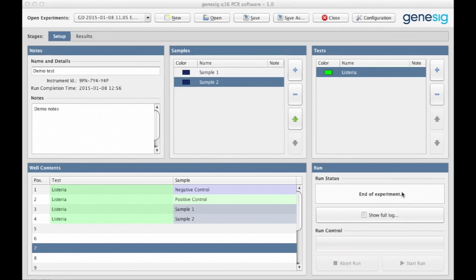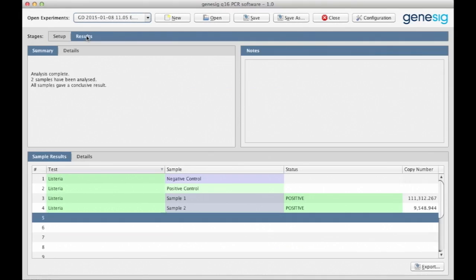In this example, we've analyzed two DNA samples looking for the presence of Listeria. You access your results by clicking the Results tab up here.